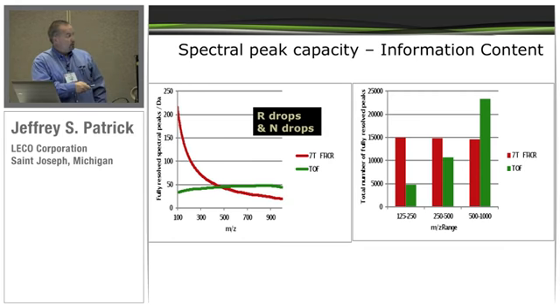So this is an FTMS in red, and this is how many fully resolved spectra you can get as a function of M/Z. You can see at your low M/Zs, you probably get some benefit here, but it makes up out here where the TOF provides more information. And if you look at it in bins, you can see that between 250 and about 1,000, the TOF starts to provide more information content, which is really where the petroleum characterization is most efficient and most significant.